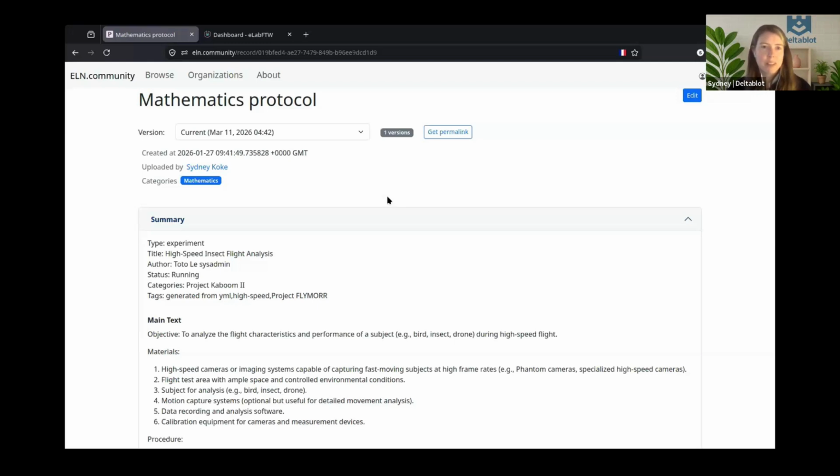Many people have read studies where a procedure is described, and when we try to replicate that study, there's just some information missing. I think this could really help with that, just showing the actual template, the actual entry in the ELN that the person used to create the data set. So hoping that people are able to use the persistent identifier URLs as a way to track what version of a specific template, and also assign authorship in that way. And that encourages people to also share these too in the spirit of open science.